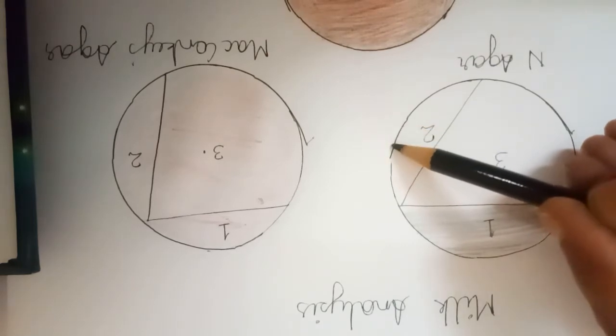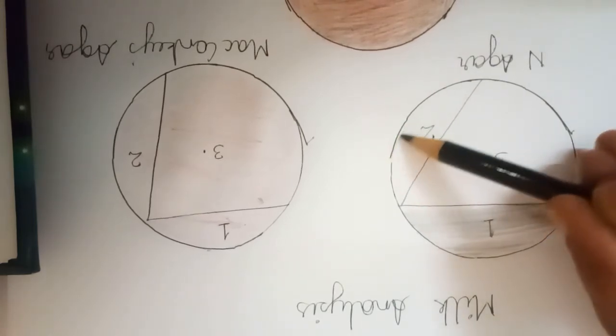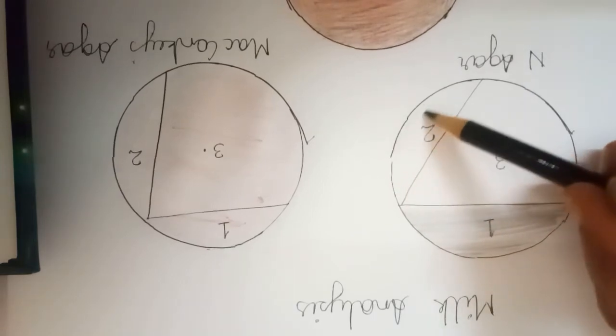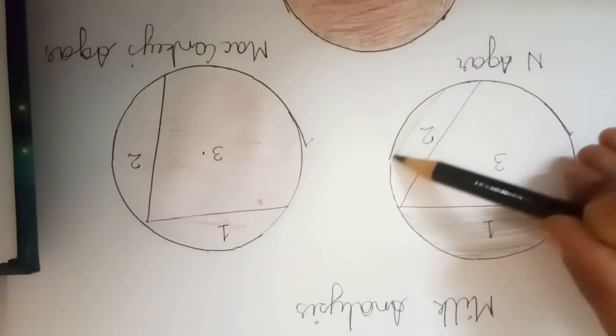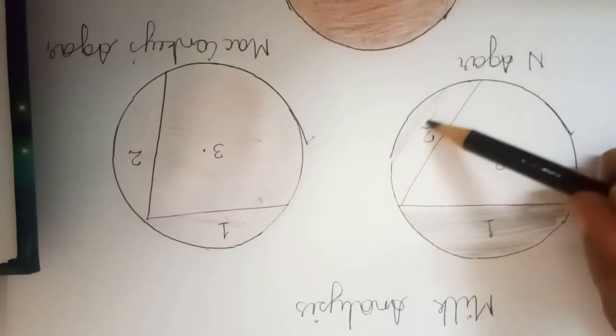So with the help of loop again, like this. Okay, very steadily, and you have to make the streaks very close to one another.